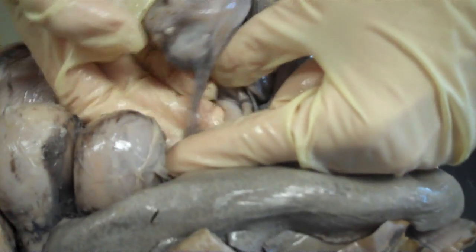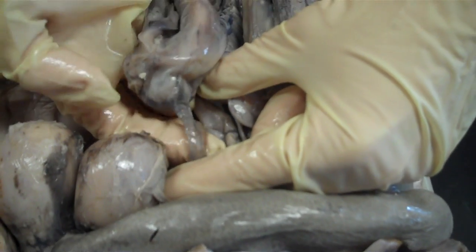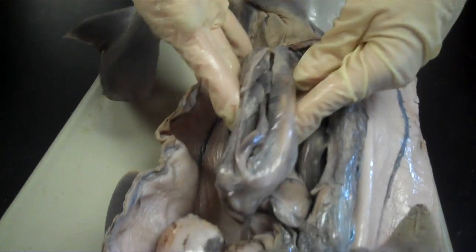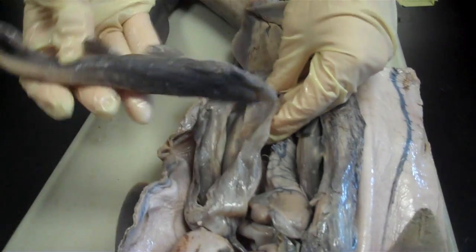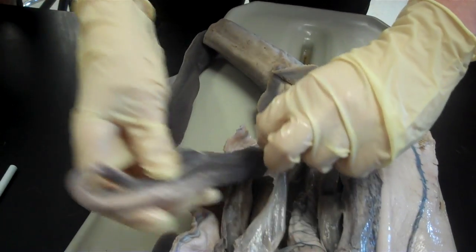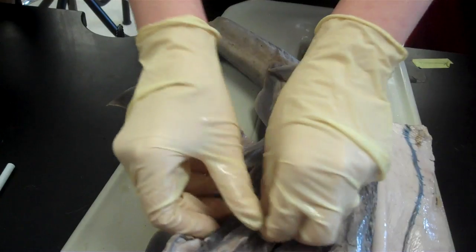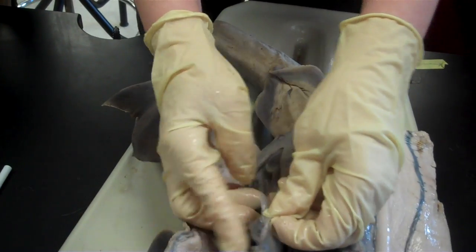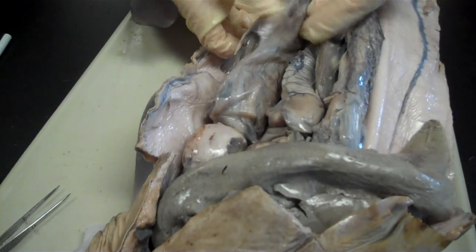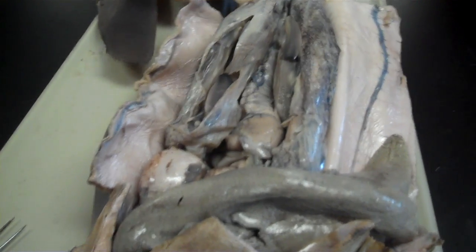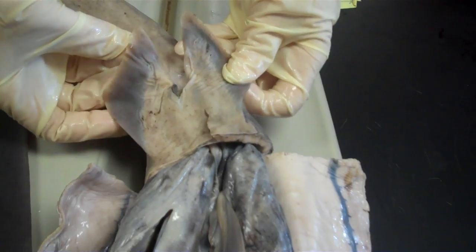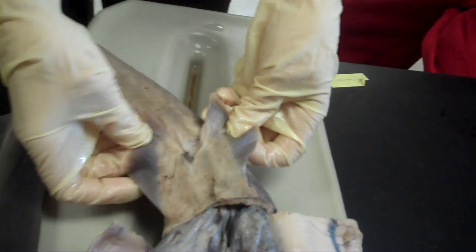The ovaries lead to this tube structure here. That's the oviduct. Oviduct leads to the uterus, and this is a pregnant uterus. And you can see the babies inside. So the babies, when they're ready to be born, would come out of the cloaca again. So you can see she does not have claspers. That indicates that she's a female.